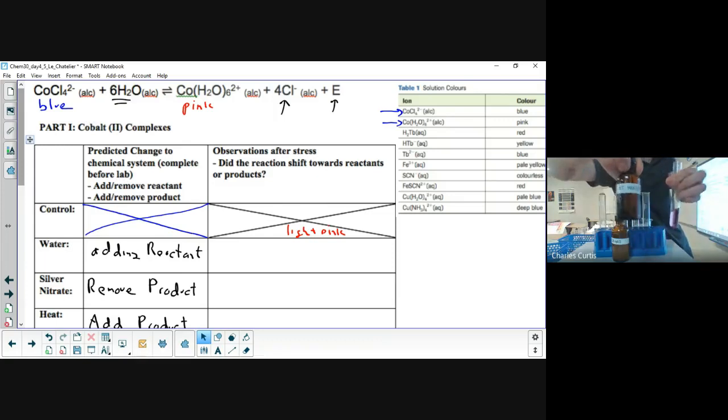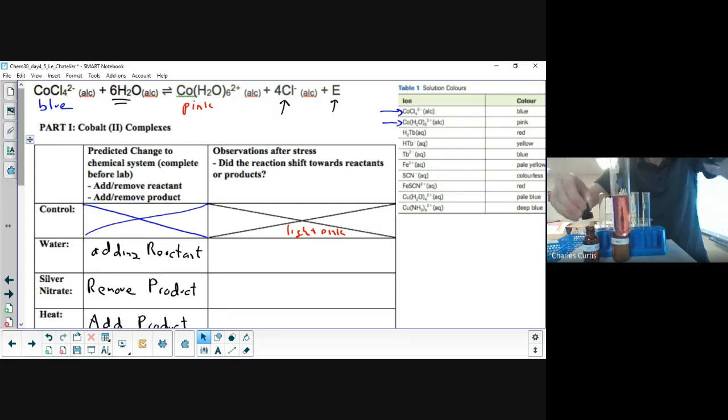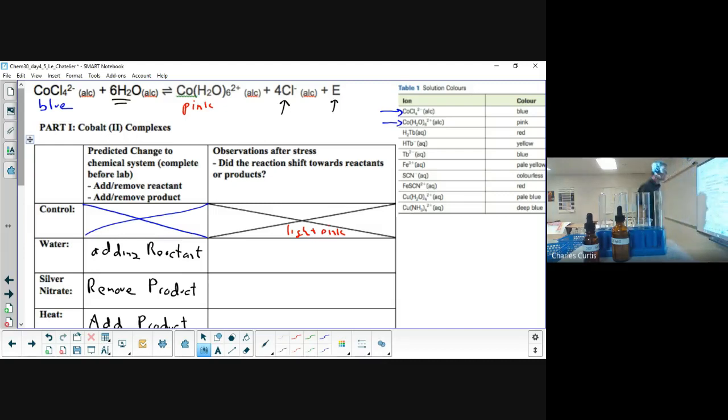Just confirming, I do have my distilled water. And I'm definitely not seeing any blue. Add a bit more. Yeah, no blue forming at the top. I'll give it a shake. And we're seeing, if anything, it's a little bit more pink. So for observations after the stress, it is still a light pink. So either it didn't do anything or it shifted a little bit more towards the products.